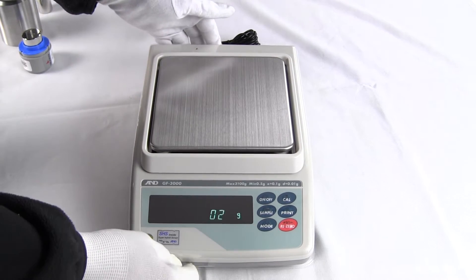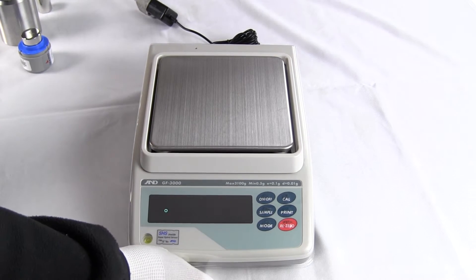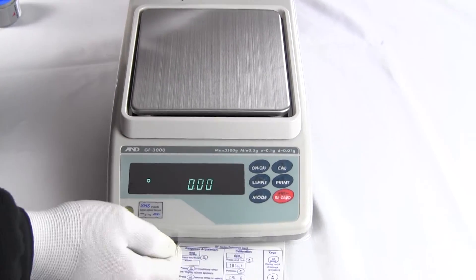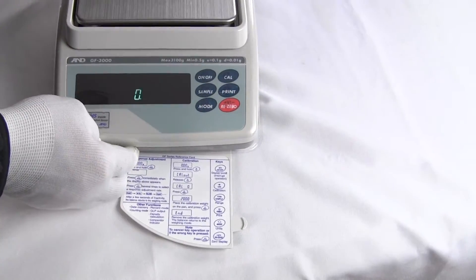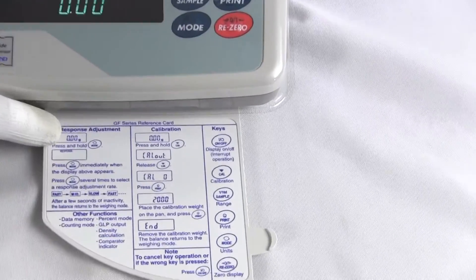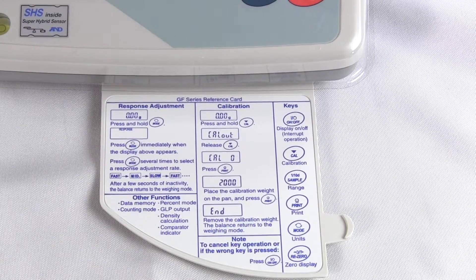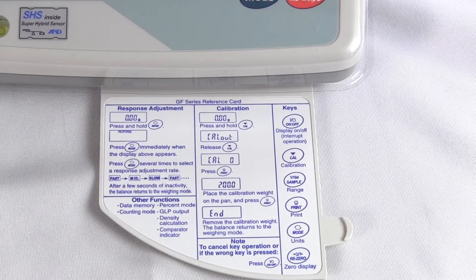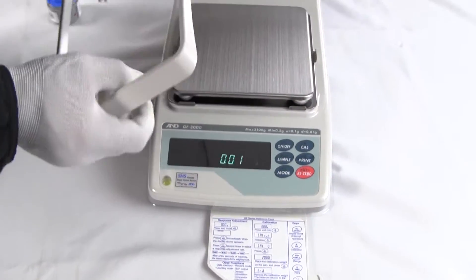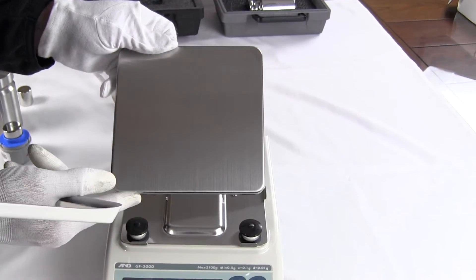This particular model is one of many in the GF series. The balance has external calibration only. One of the hallmarks with the A&D line is this little card that you can flip out — it shows you how to operate the balance and what each of the keys does. This balance has a 6.5 by 6.5 inch stainless steel platter, and it's very large. A lot of people buy the A&D line for the large weighing pan.